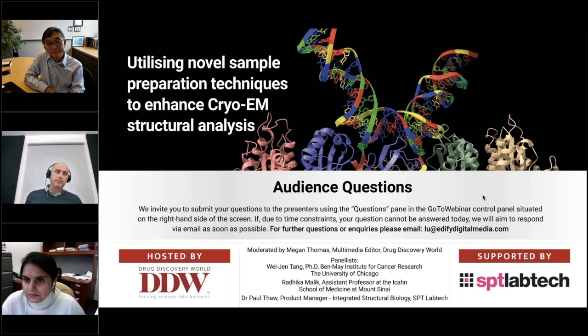Right. So I can give you an example of the time-resolved cryo-EM. Typically for the protein IDE, we use about 1 mg per ml. And when we had to do the time-resolved work, we had to target around 3 mg per ml.